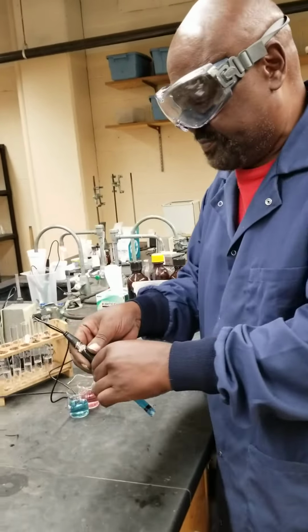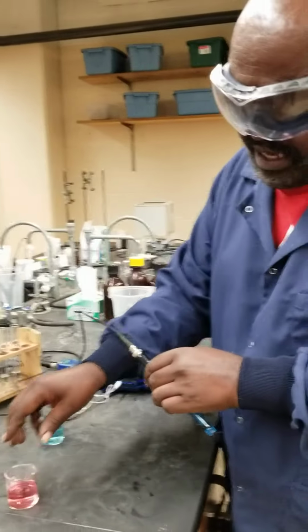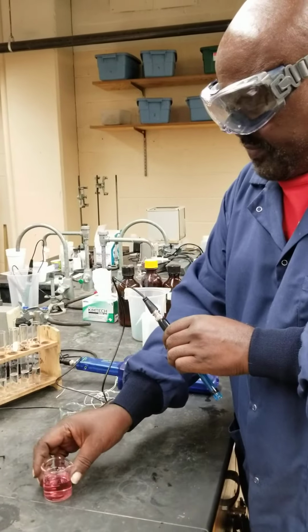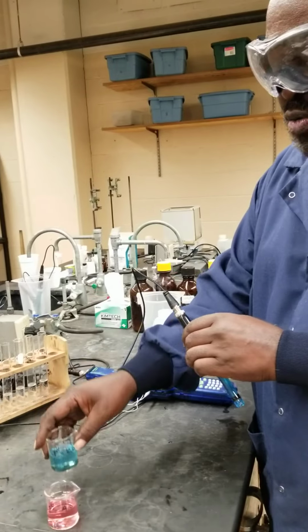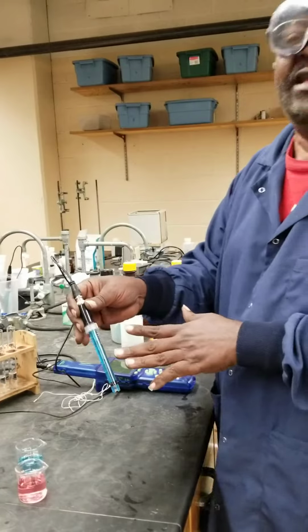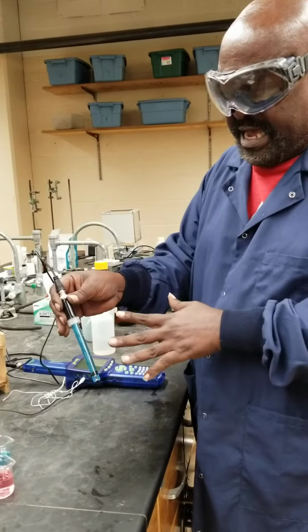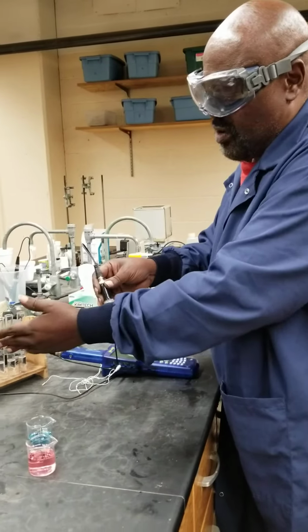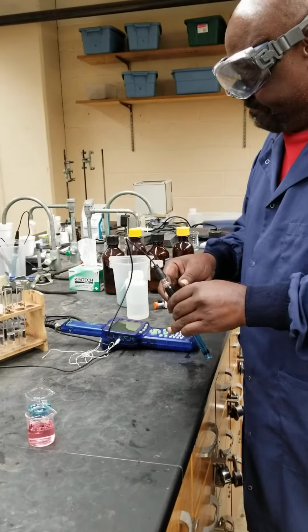So what happens? Well, up here, I have buffer solutions. This is pH buffer 4.0. This is pH buffer 10.0. We're going to use these two to calibrate the pH electrode. And then, when we're done, we're going to measure the pH of the buffer solutions we create.